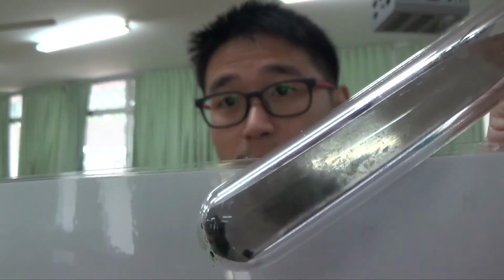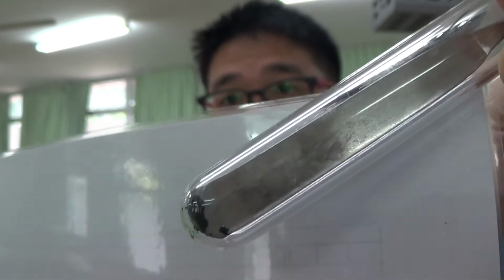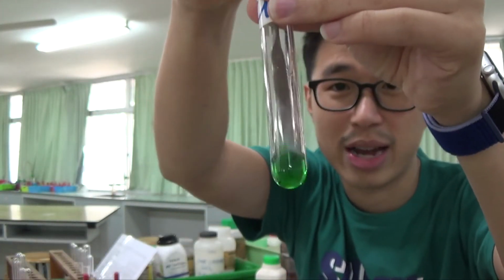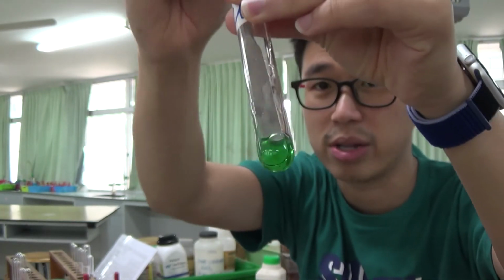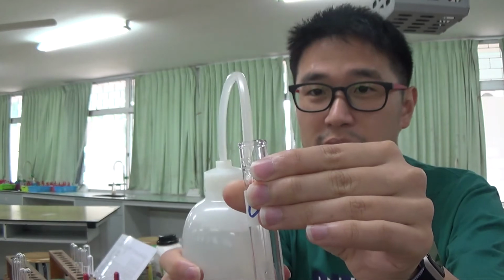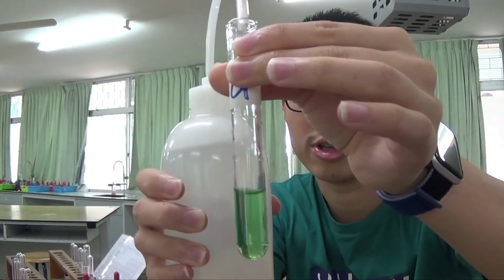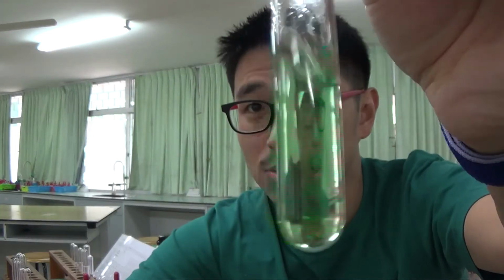Even in exam, okay, you see, I don't know if you can see. There's the metal spatula and there's a bit of green solid. The chromium(III) chloride is a green solid, and it gives me this very nice green color solution, kind of light green. So it's very easy to tell, really, just by looking at the color of the solution. You remember the iron(II) was not a very intense color, right? So even after I add water, the green color as a result of chromium(III) plus is still pretty green. Even after I add a lot of water, it's still pretty green.